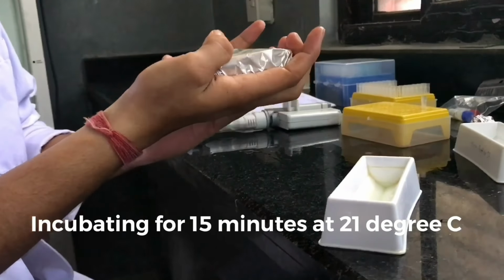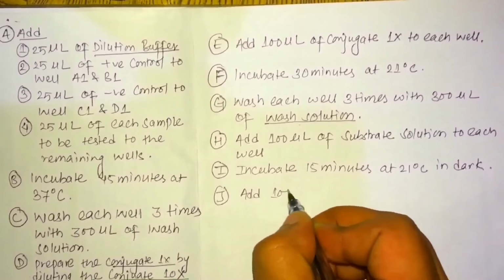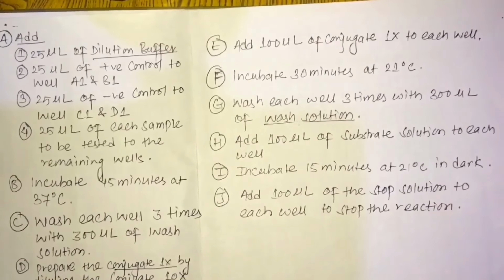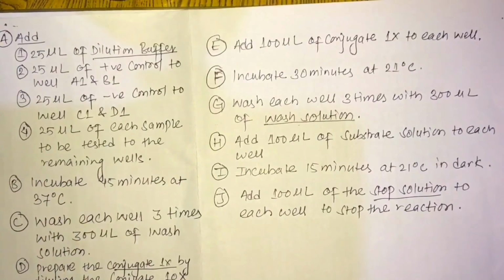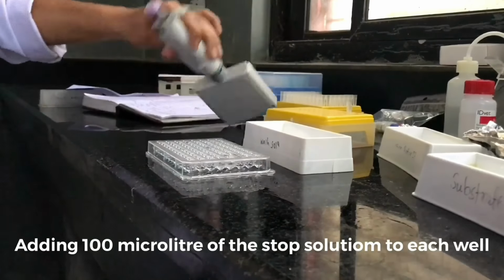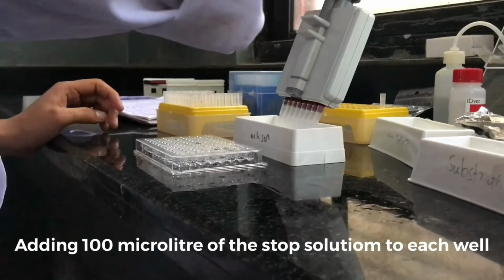This is the last incubation that we are doing. Now we will add 100 microliter of stop solution to each well to stop the reaction. So taking it out from the incubator, then we will add the stop solution. The stop solution is also provided with the ELISA kit itself. So here we add stop solution in each well of the 96 well plate. Again, we are using the multi-channel micropipette.